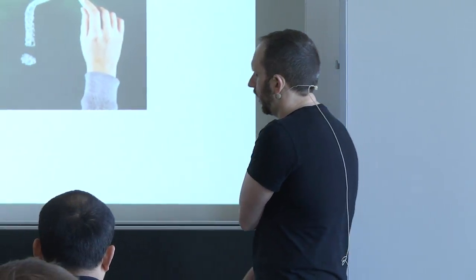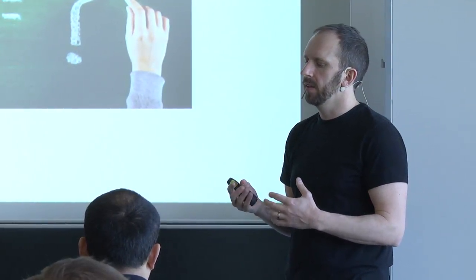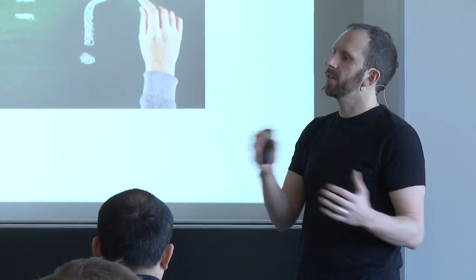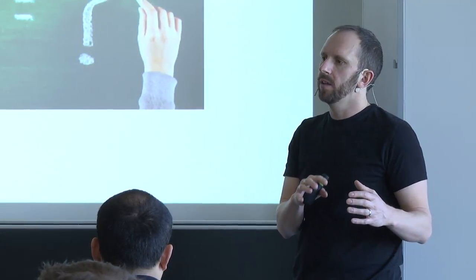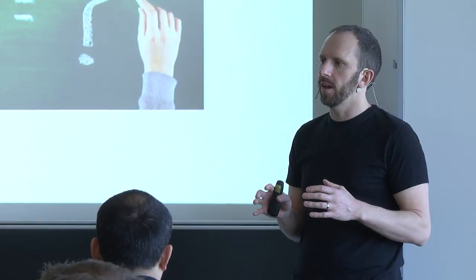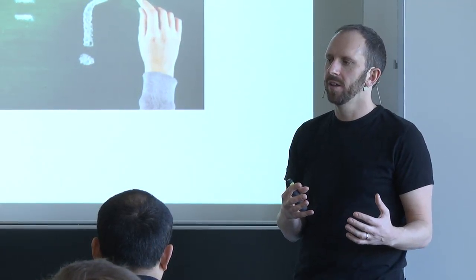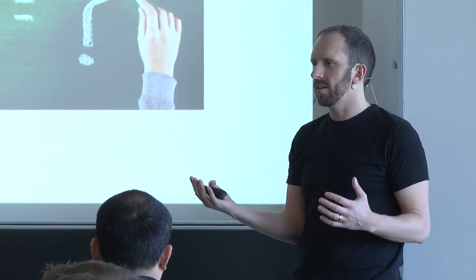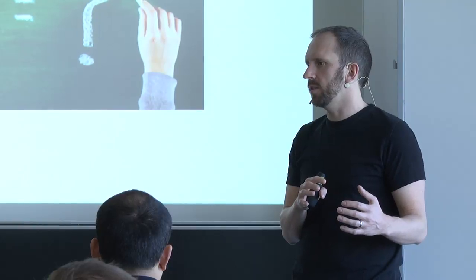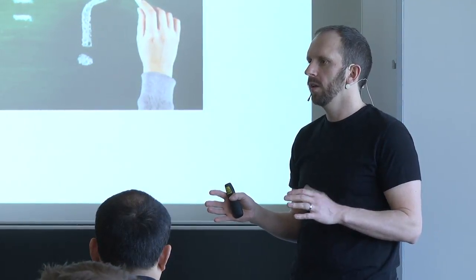Right. Well, in our specific case, there are several reasons. One is kind of historical, right? Rudy's group has been developing these TPP tools for a long time, and we're comfortable with them and think that they work very well, and we know how they work. Whereas Protein Pilot, you don't know how it works, right? It's a commercial tool. This is kind of a concern. Same with the search engines. We tend to use the open source ones where the math is published and we know what they're doing.